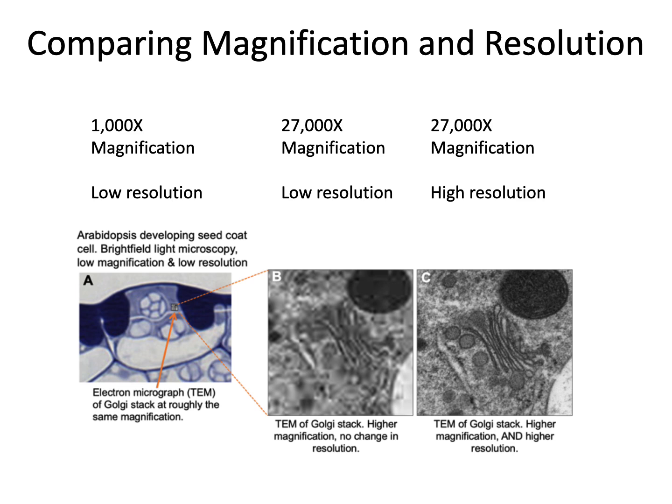Normally with light microscopy, you're not seeing things like Golgi. You're not seeing mitochondria or the membranes within mitochondria without some additional approaches. But with electron microscopy, that's totally doable, just in terms of magnification.